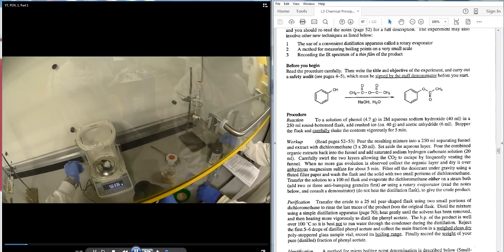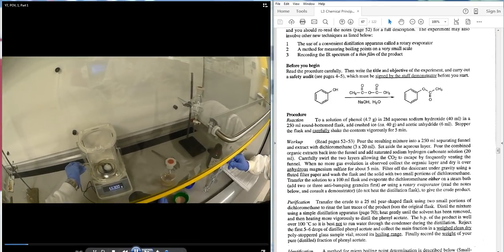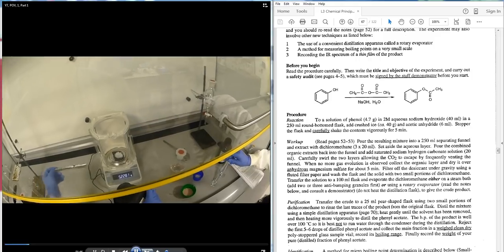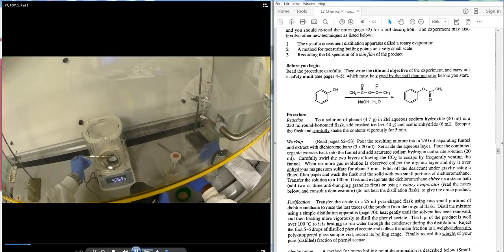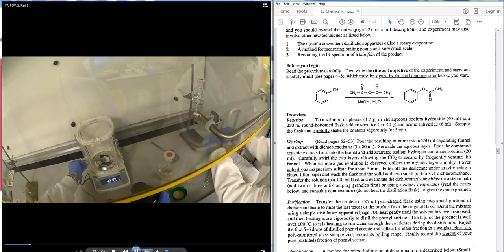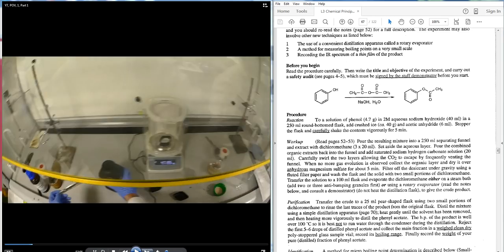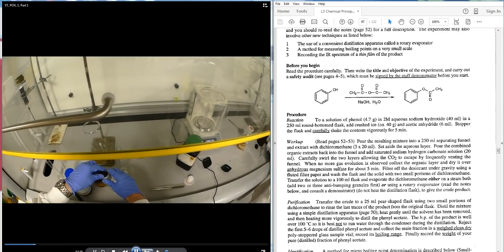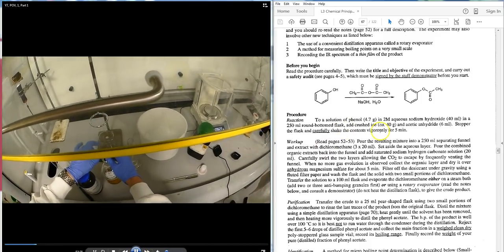We can see the student weighing out the phenol. Moving forward slightly, the student is measuring out a mass of phenol — 4.7 grams — and placing it into the round bottom flask.